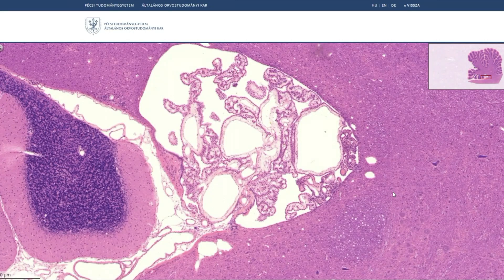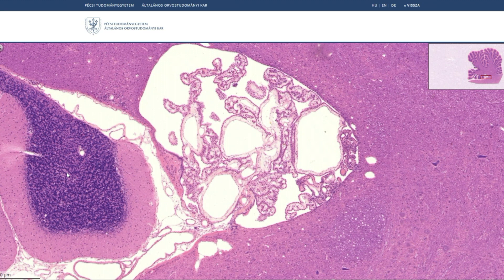This part of the cerebellum shows one folium upside down. As mentioned earlier, the molecular layer is the outermost and is relatively pale. Then you can see one row of Purkinje cell bodies — this is the Purkinje cell layer. The innermost, which is the darkest, is the granular layer with the granular cells. The little pale spaces within the granular layer correspond to the cerebellar glomeruli.